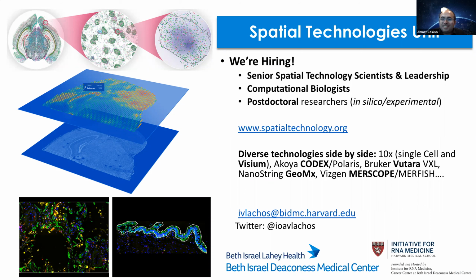Great. And let's say if they want to get some preliminary data, could they work with your group or unit? Yeah, of course. I mean, it's a facility. It's a service. So there are opportunities to collaborate with the lab, but you don't have to. You can work directly with the unit. We have specialists in there, and they will work with you, guide you, match your question to the instrument, or if you already know, just make sure that it is the right assay for you.